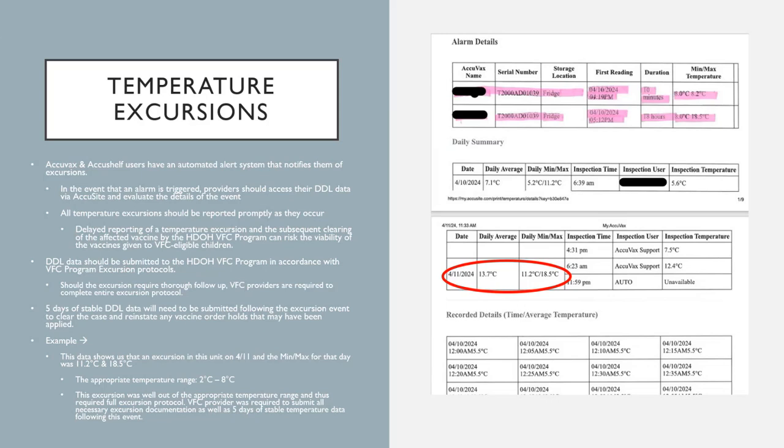The DDL data should be submitted to the VFC program here, and it is a program requirement, of course, for any excursion that may occur. Should the excursion require thorough follow-up, VFC providers are required to complete that entire process. Just like any other temperature monitoring user, AccuVax or AccuShelf users have to submit 5 days of stable data in order to show us that the unit has stabilized since the last excursion occurred.